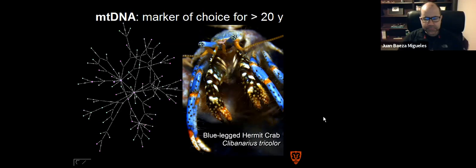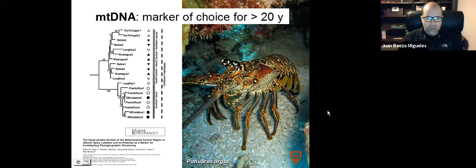What I want to focus on during this talk is the methodology and how to improve the retrieval of entire mitochondrial genomes, profiting from third generation sequencing. So I was mentioning that short fragments or the entire mitochondrial genome have been a marker of choice during the last 20 years.